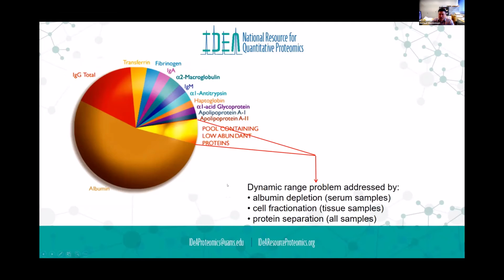Something we haven't really touched on much, I don't believe, is the dynamic range issue. This is pretty much an issue, at least to some degree, with any complex sample, any cell lysate or anything like that.